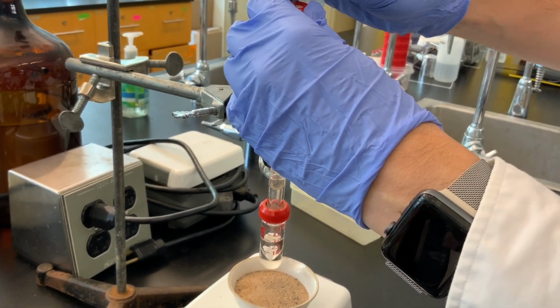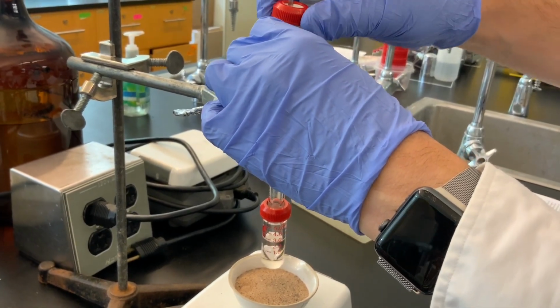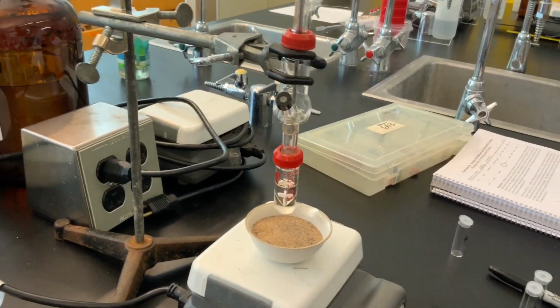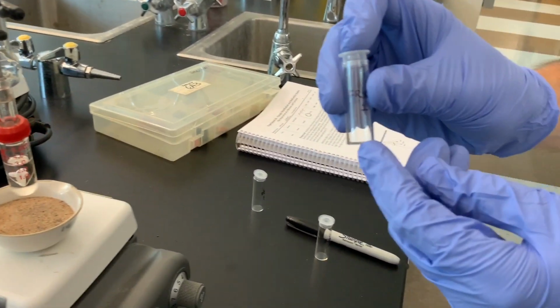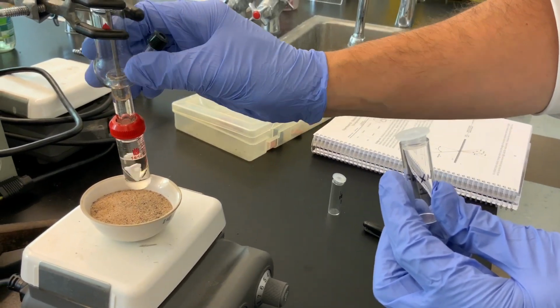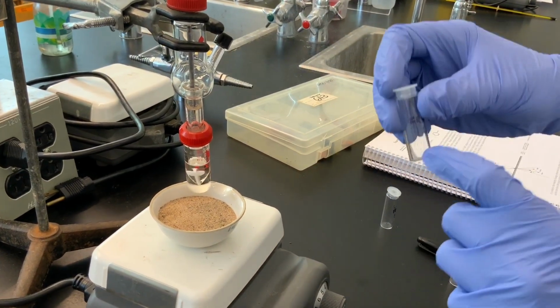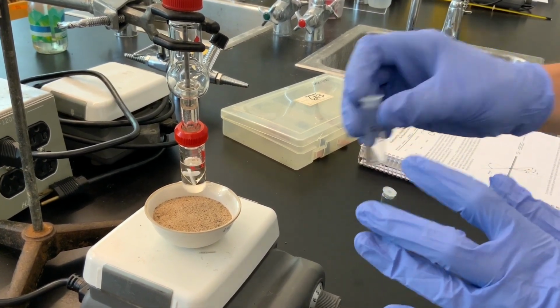And then as the hexane distills out, we'll see that the temperature will drop somewhat because there's no more hexane left to distill. So that should be our first fraction, and then we'll separate it into this little sample vial. We're going to collect our distillate just like we did in steam distillation through the sidearm of my Hickman-Hinkle still head. And so that should be, if we're good at this, the hexane should be pure.